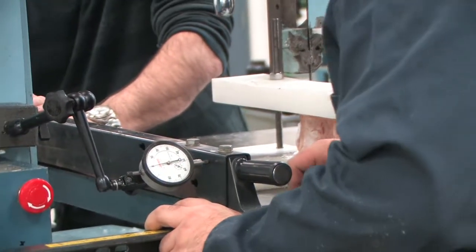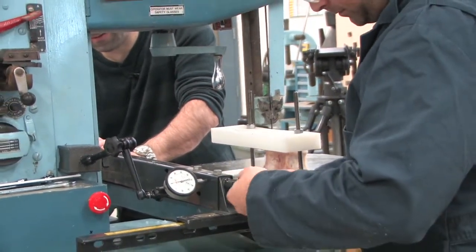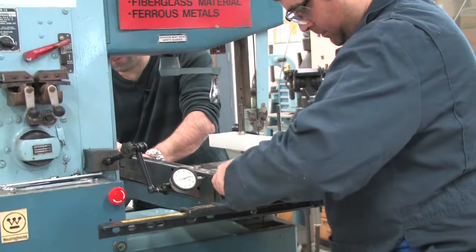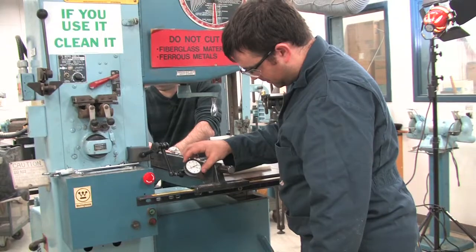Depending on the saw, a guide will have to be used to keep the cut straight. A guide that connects to the table of the saw is used in this example. The far edge of the chuck will slide along the guide bar as it cuts, keeping the cut symmetrical.